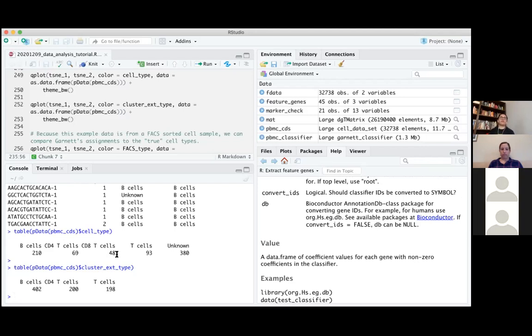One more thing I forgot to mention is when you make the marker file, you can use, I'll mention that later, actually. I don't want to confuse. But you're right. Sometimes you can just have data sets that don't have enough cells. So it's not compulsory to use this option, I would say.